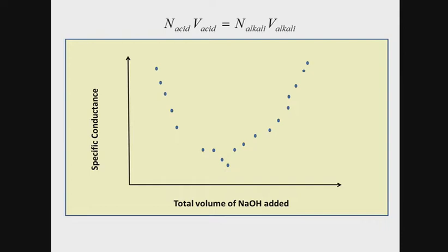And therefore, the task at hand is: given the strength and the volume of the acid solution, how do we determine V alkali?